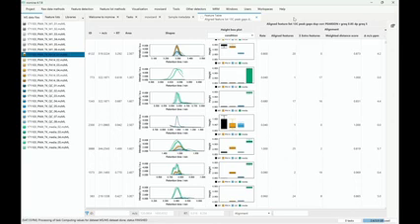For example, if you use a very old MSConvert method to convert your data to mzML, and you pick the vendor algorithm because hopefully it's the best one you could use for centroiding, but there was something else done before. Actually, the title maker was by default done before. Then it would actually use a different algorithm, and it would put zero intensity signals there. So there's a warning for this.